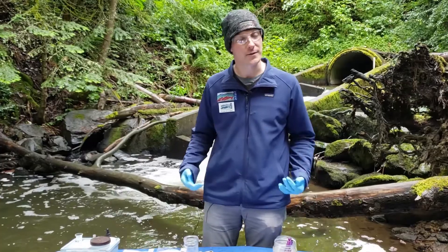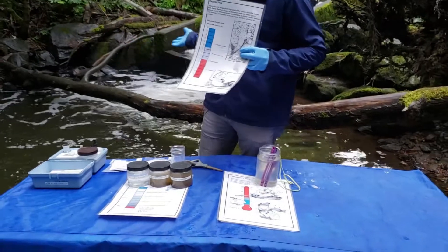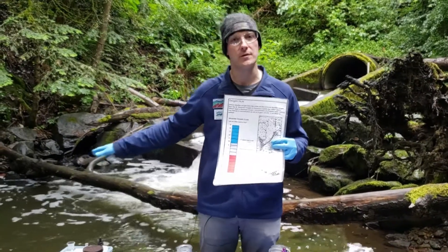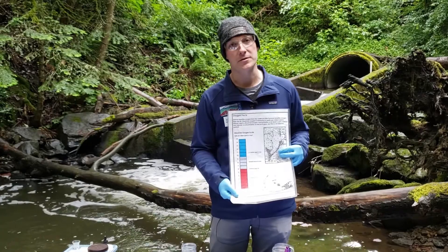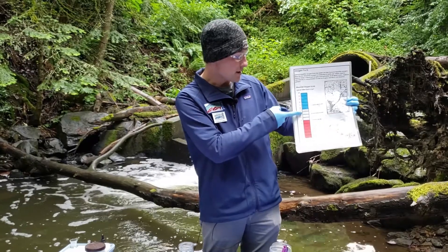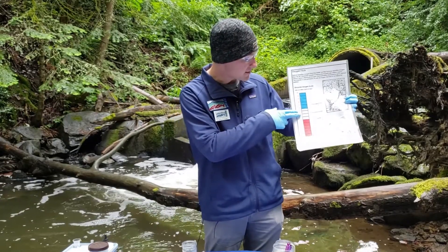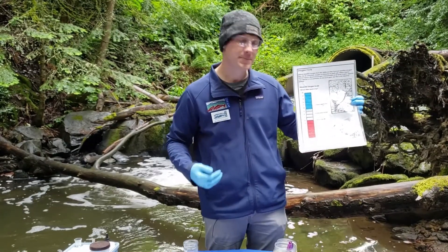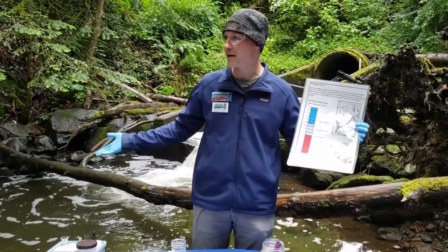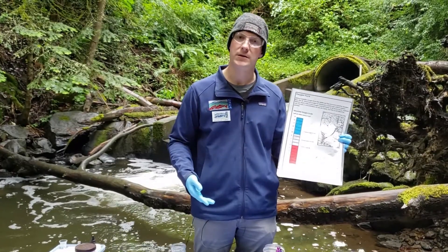The first test I'd like to start is the one that takes the longest, and that is dissolved oxygen. You may be able to see behind me there's a strong current, and that current is helping to mix the oxygen from the air into the water and be accessible for the salmon to breathe. If you look at this chart, salmon tend to prefer a high number of dissolved oxygen — about nine or above is considered excellent, six to nine fair, and below that is poor. Adult salmon and their eggs cannot survive in low oxygen environments. A creek like Padden Creek has a current versus a pond or stagnant water, which wouldn't have as much dissolved oxygen.